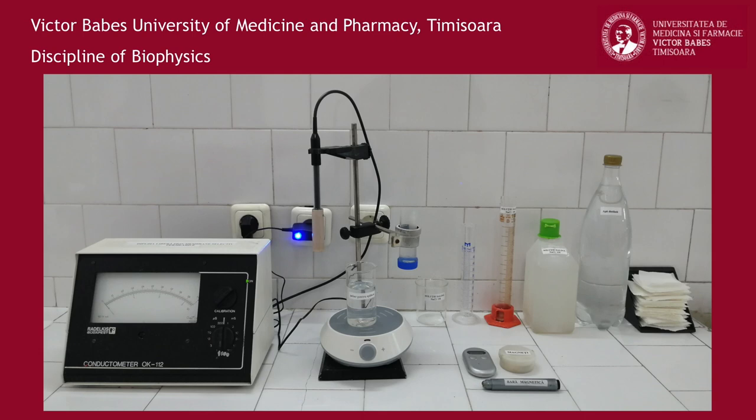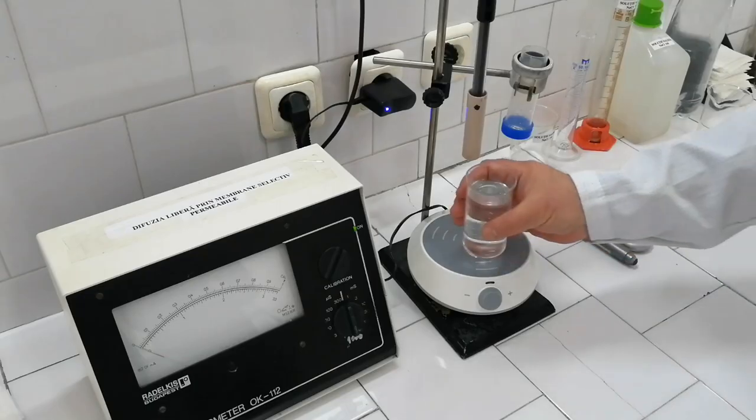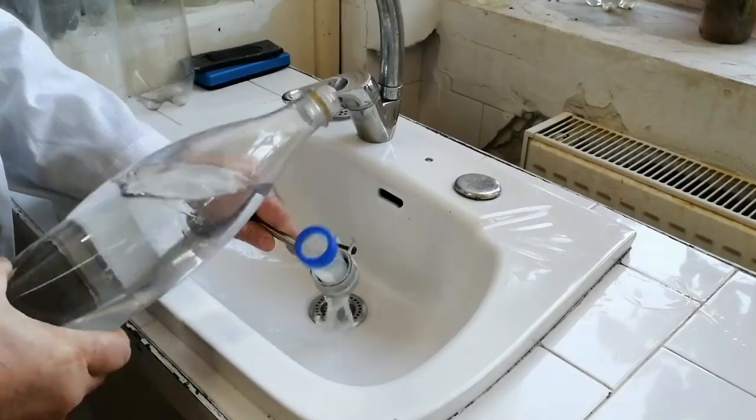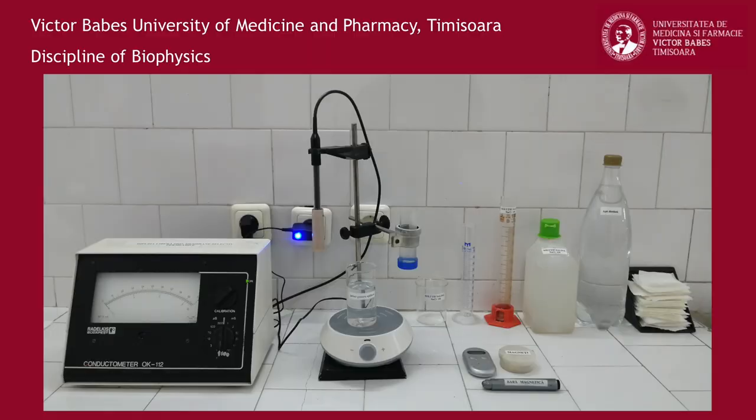For starting, rinse well with distilled water the measuring electrode, the container equipped with the membrane, and the two Berzelius glasses. Connect the conductometer and the magnetic stirrer to the power outlet.